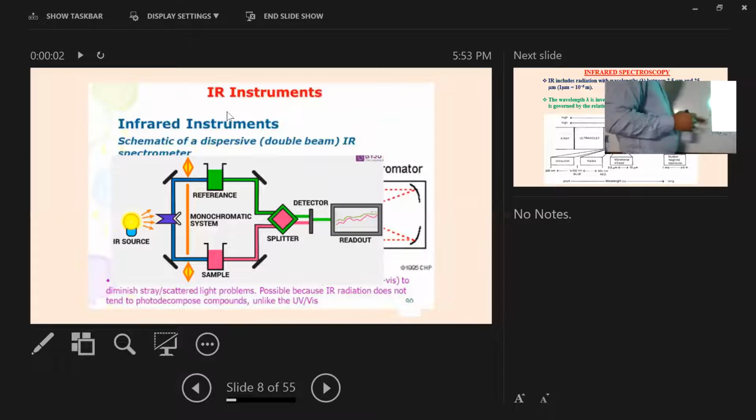Okay, so if you increase the wavelength from this source, or you change the wavelength, and you have the water molecule inside, in that case, you are expecting to absorb only these three wavelengths. We have the possibility to change the wave number. Actually, I should not say the wavelength. This is wave number in frequency.